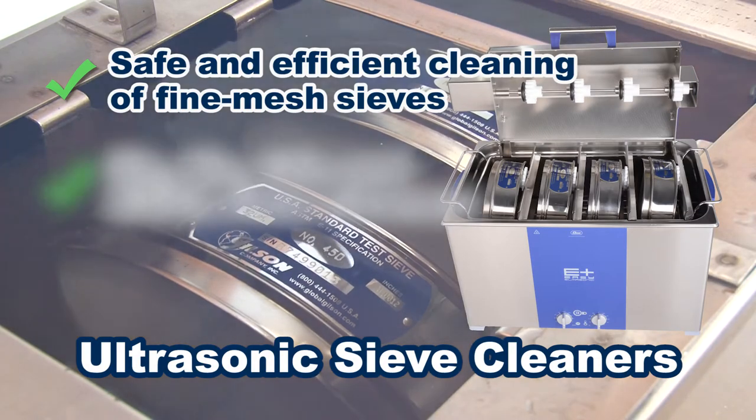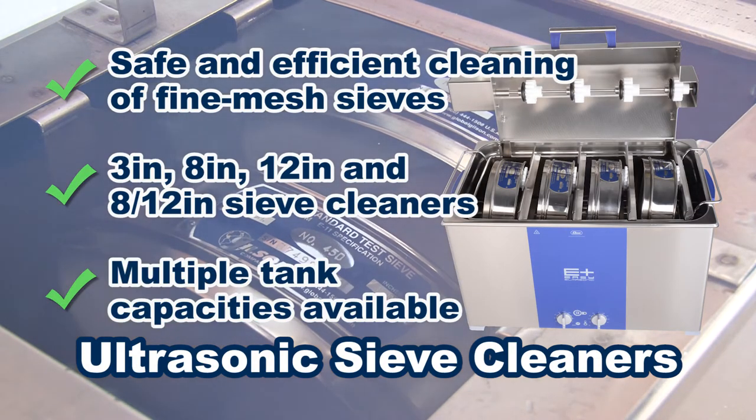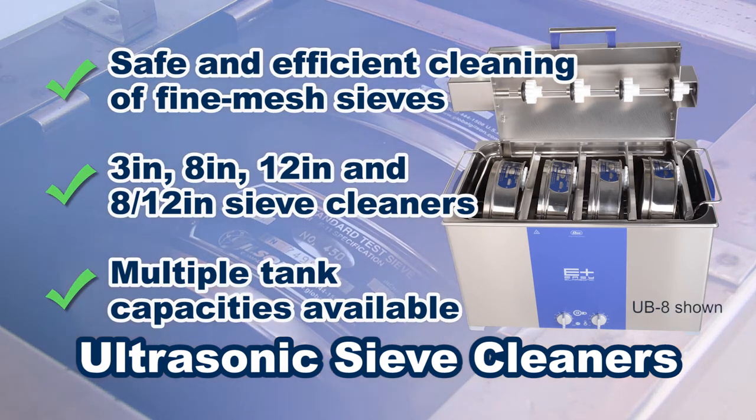Ultrasonic sieve cleaners are designed to clean multiple sieves at one time with a fast but gentle cleaning action, preventing damage, especially with sieves with fragile mesh.